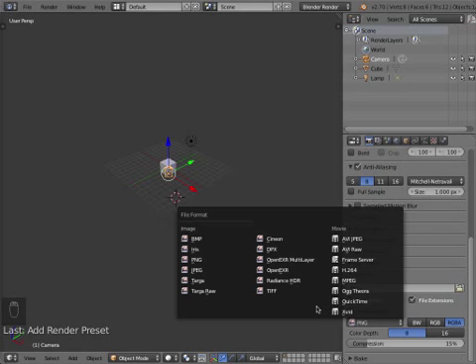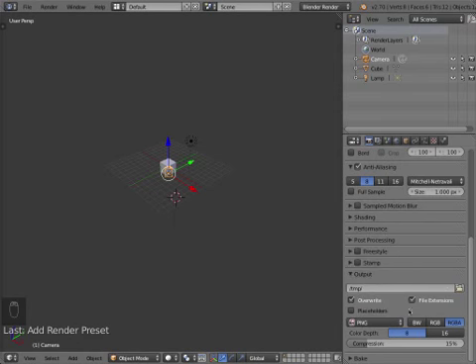But when you're rendering an animation, unless you're really sure about it, if it's a simple turntable animation, render it straight to a movie format. If you're doing a really complicated animation, render it out to images and then turn your images into a movie. Because if your render dies, if your computer craps out during the rendering, which occasionally happens, you've lost all your work. If you render it out to images, you just start where you left off and keep rendering. And then eventually delete it.